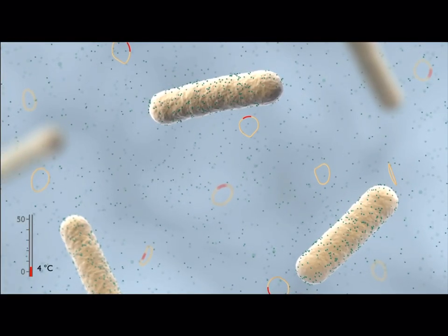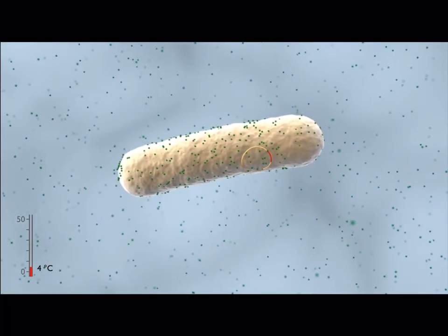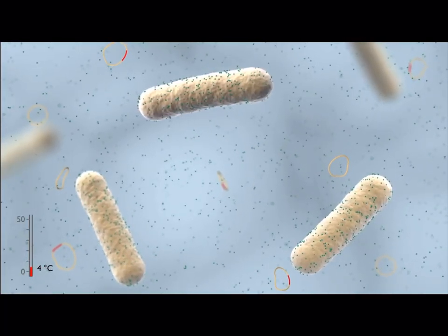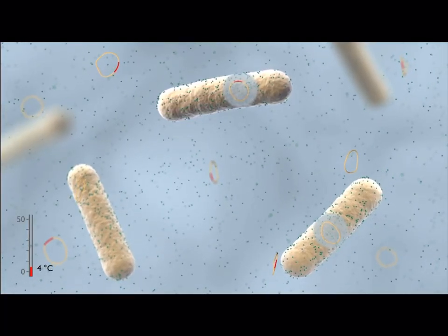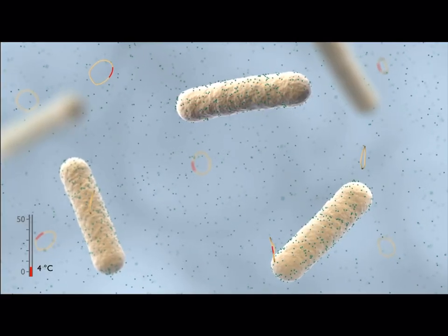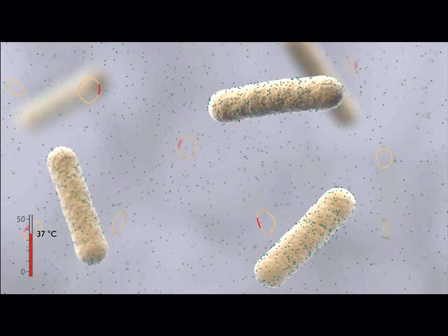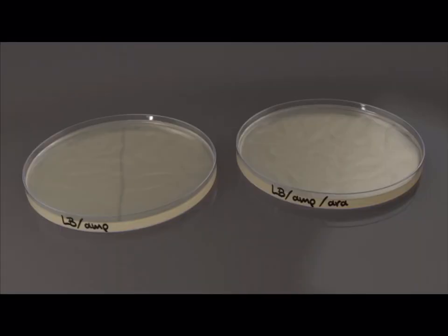This heat shock results in the formation of adhesion zones, creating a leaky plasma membrane. This may enable the cell to take up a plasmid from the solution. After heat shock, the bacterial cells are placed at 37 degrees Celsius and allowed to recover before being plated. Bacterial samples are now put on agar plates to test for successful transformations.